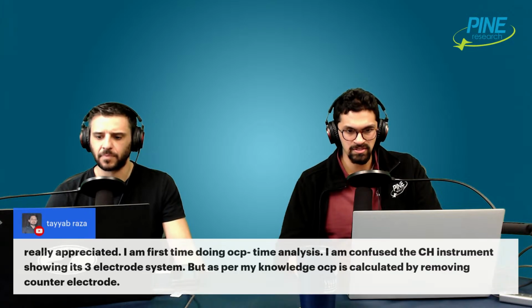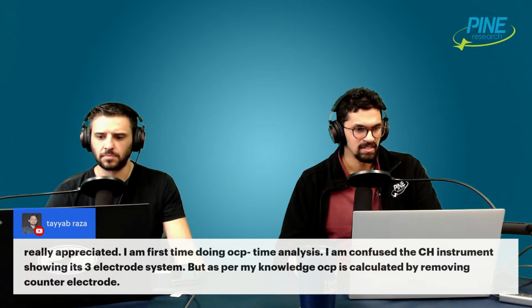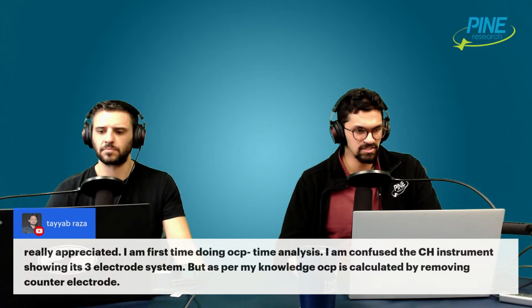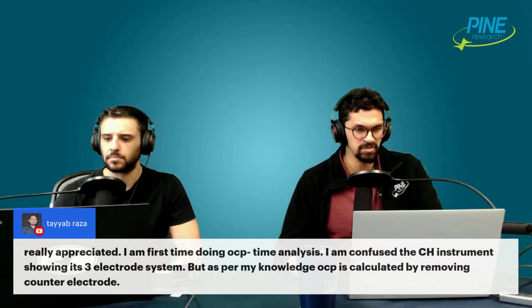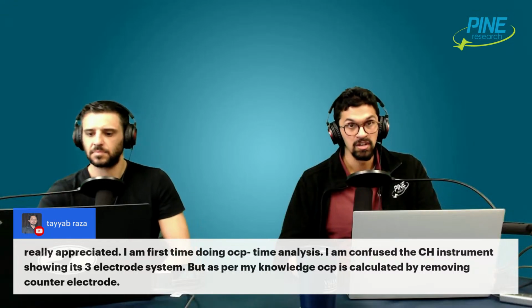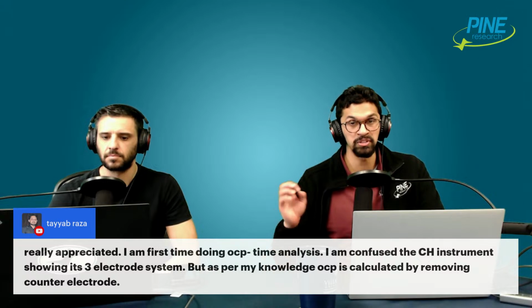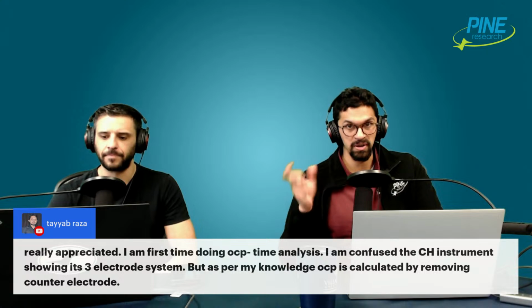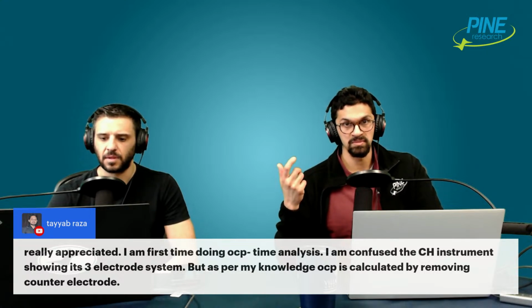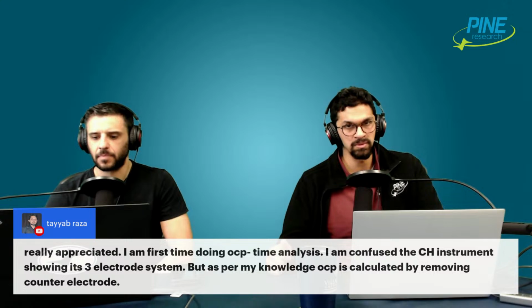And then there's one question from Tayab, who's doing open circuit potential versus time analysis for the first time. He's using the CH Instruments 3 electrode system, but his knowledge is that OCP is calculated by removing the counter electrode. You can keep the counter electrode in, but the open circuit potential is only measured between the working and the reference electrode in a 3 electrode system. So whether it's in the solution or not, it wouldn't matter.